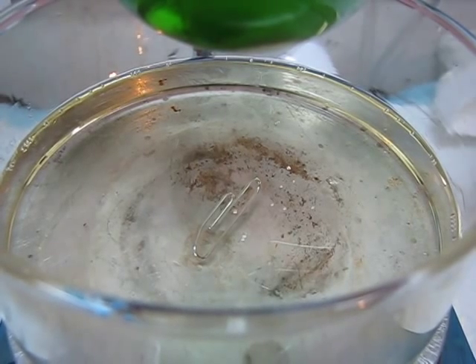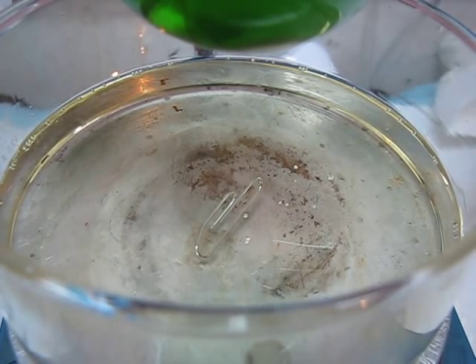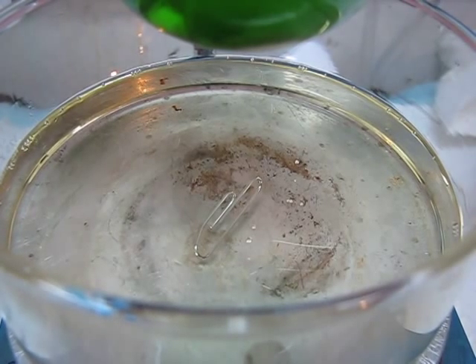A trick to counteract that is to add a stir bar into the bottom of the bath. However, stir bars are expensive, and if you spin them at the wrong speed, they can lose control and either hit the sides of the flask or the sides of the bath, causing glass breakage and a large hazardous problem — either fire or chemical all over the place.